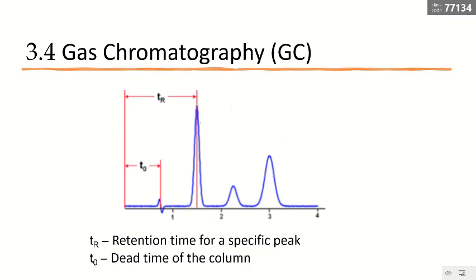So you know this retention time, the first peak, for example, that is the retention time. The T0 here is the solvent coming out. You don't have to be frustrated by it too much. Basically, when we do the injection in the machine, the solvent will be the first one to come out. It gives us an indication of how fast the analysis could be, or sometimes we call it the dead time of the column. It's okay. It's not our real peak.